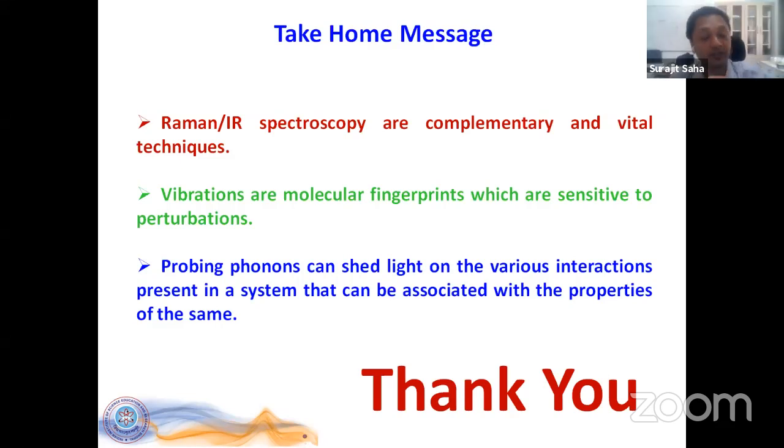I mean, the response depends on the orientations of the crystals that one may have. So the scattered light will have all possible contributions of the polarization. Now one has to use an analyzer to choose or select from those, and then we call it the polarized Raman spectrum. That will basically remove some of the peaks and only retain certain peaks, which again depends on the polarization selection rule. It depends on which mode we're talking about, whether it's the A mode or E mode or F mode. Polarization will have selection on these modes depending on the orientation of the polarizer or the analyzer that we're keeping, and we'll be able to see only certain modes and not all the modes. One can do polarized Raman almost everywhere. You just have to have an analyzer which is useful for that particular laser.